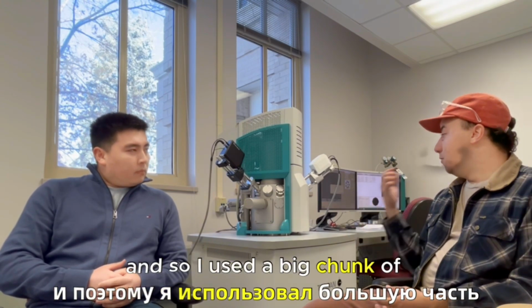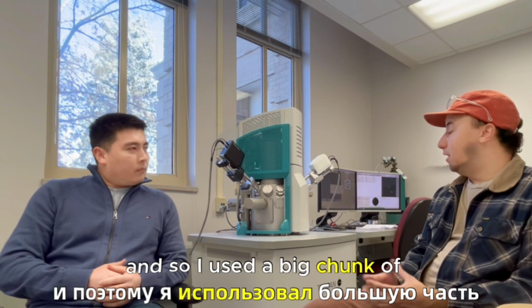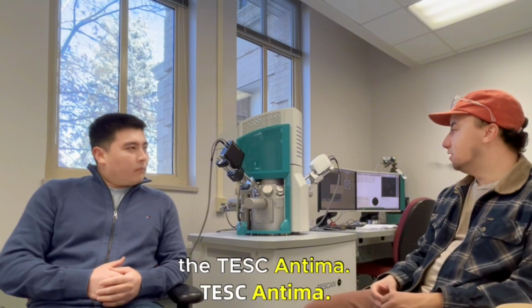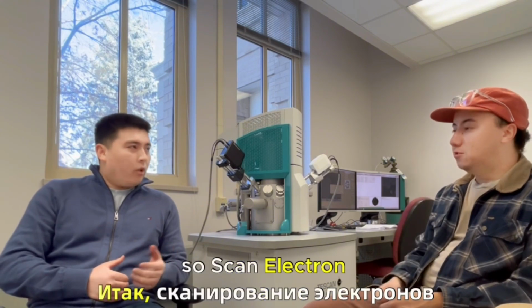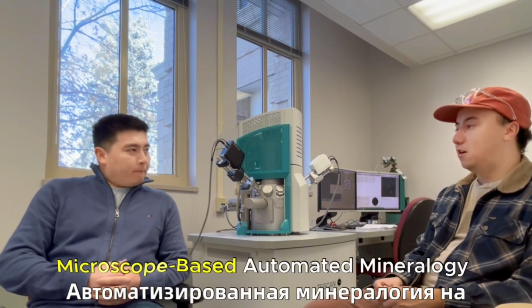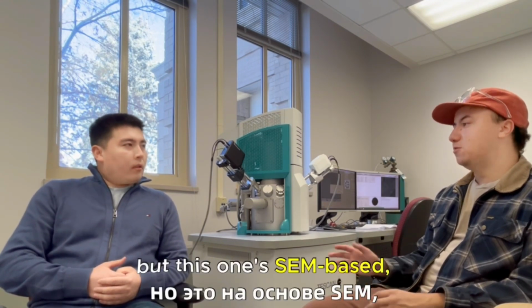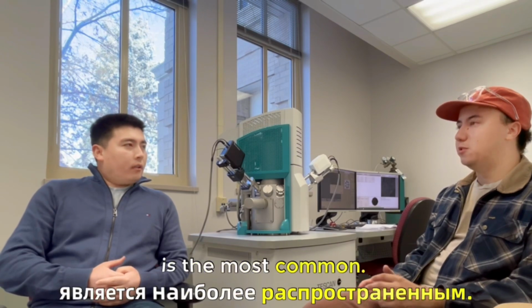And so a big chunk of my research is based off of automated mineralogy data generated on this instrument, the TESCAN TIMA. I see. Yeah, so it's scanning electron microscope based automated mineralogy. There are other automated mineralogy platforms, microprobe, XRF, but this one's SEM based, which I think is the most common.